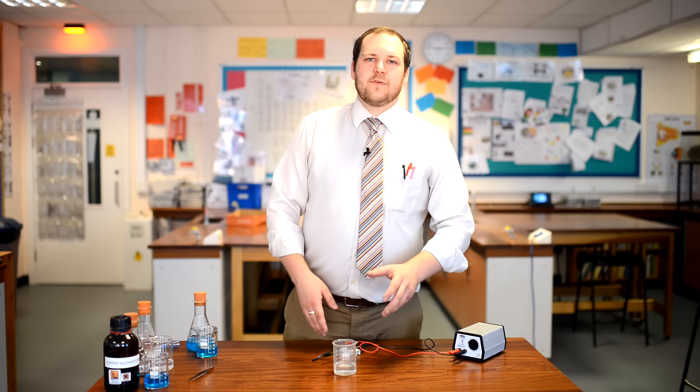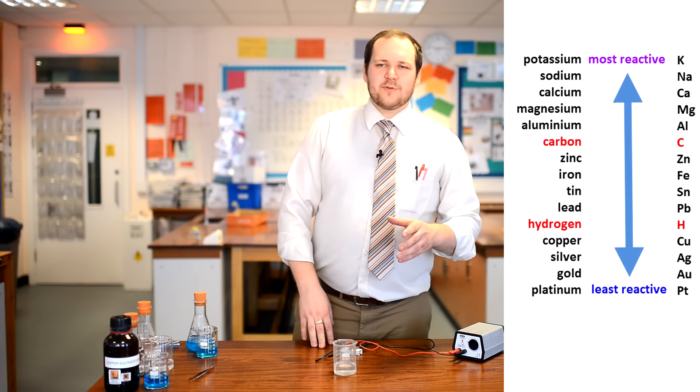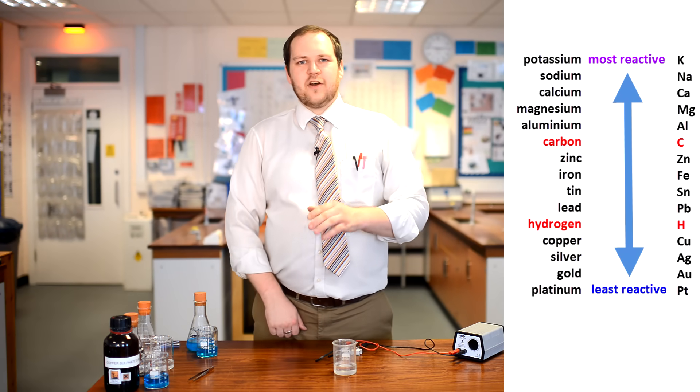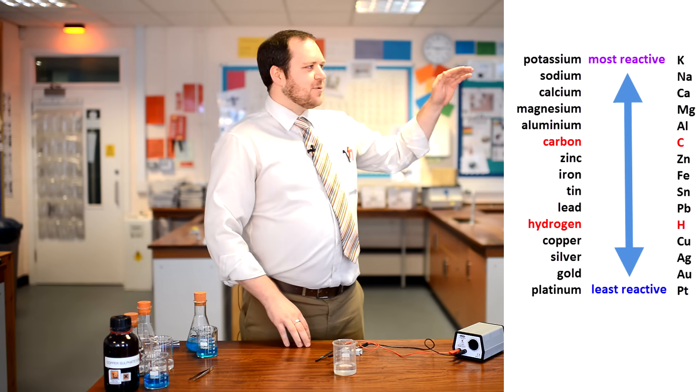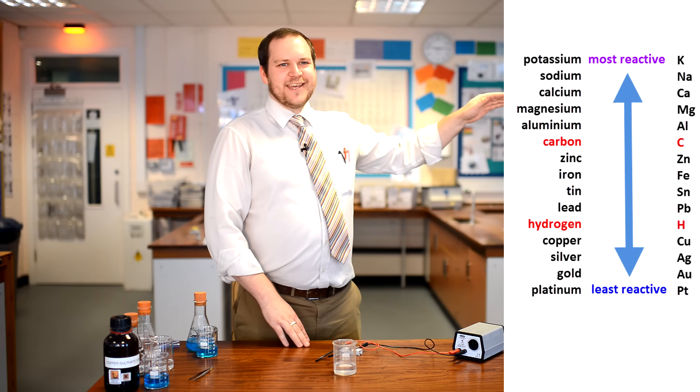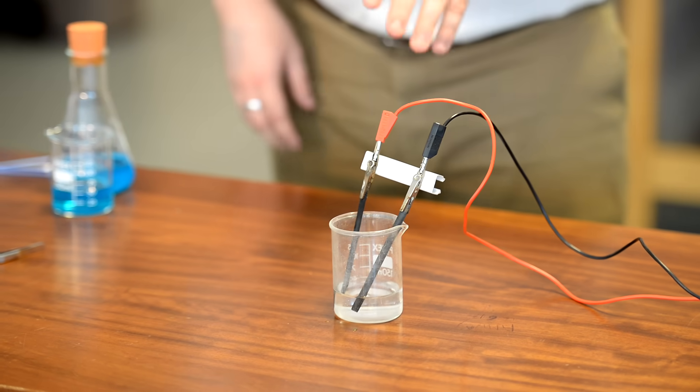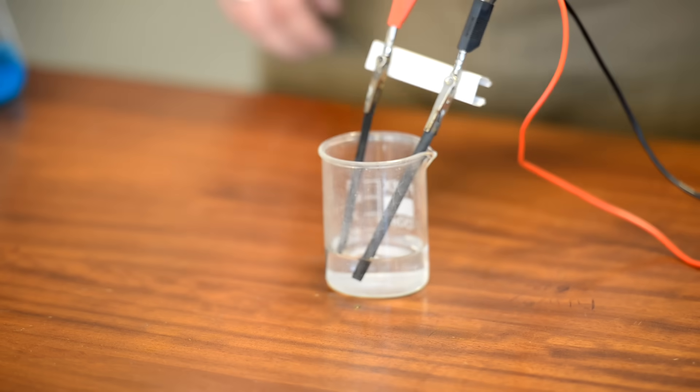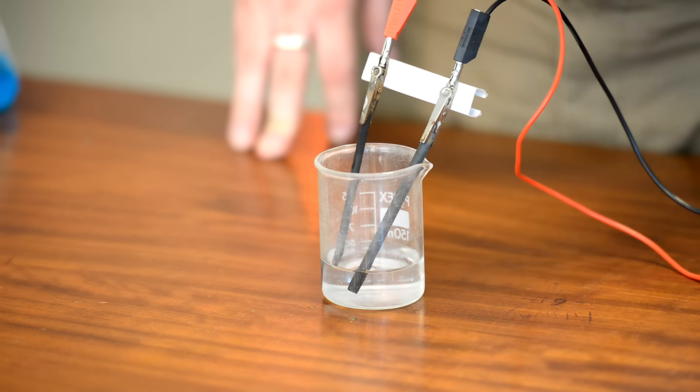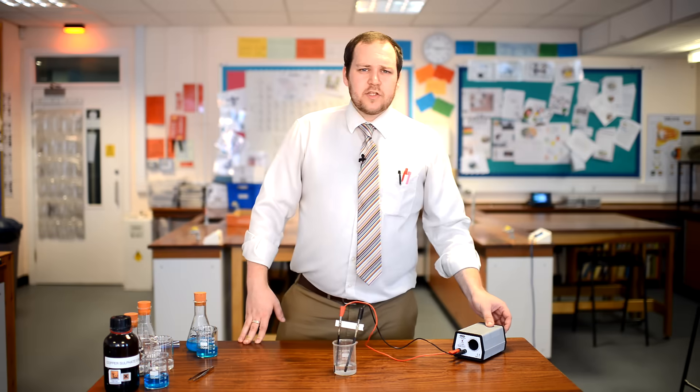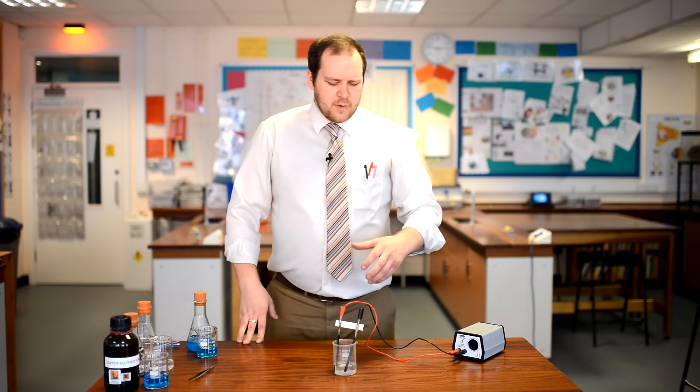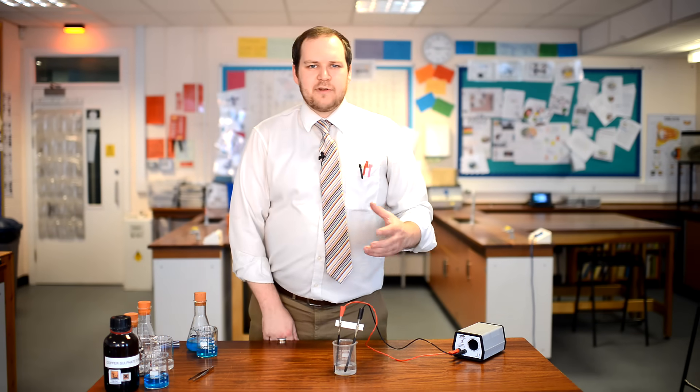We are now going to do a test with sodium sulphate. Sodium sulphate contains a metal that is more reactive than hydrogen. Sodium, you can see, is far higher in the reactivity series than hydrogen is. Once again, making sure that the electrodes aren't touching, I am going to put the electrodes into the sodium sulphate, making sure that the bottom of the electrode is covered again. I am going to turn the circuit on so that the electrons can flow and that should allow us to see a reaction starting.